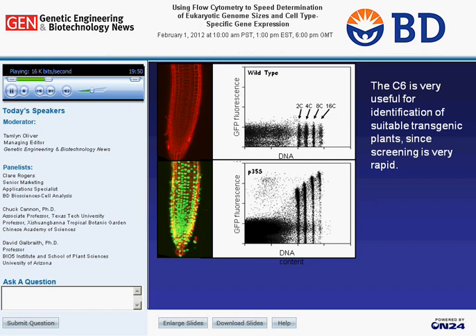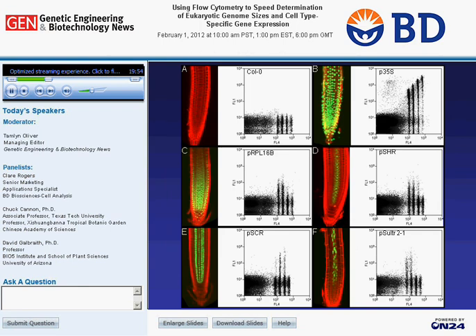In the next slide, you can see examples in which we've taken many of these different types of plants and chopped them up and analyzed them. And you can see interesting things immediately. So in panel E, we're looking at a promoter which is active in the endodermis, and you can see from the DNA content distribution that those cells are 4C and 8C, whereas for the phloem companion cells in panel F, you can see that there are 2C and 4C. So interesting information pops out immediately using the C6.